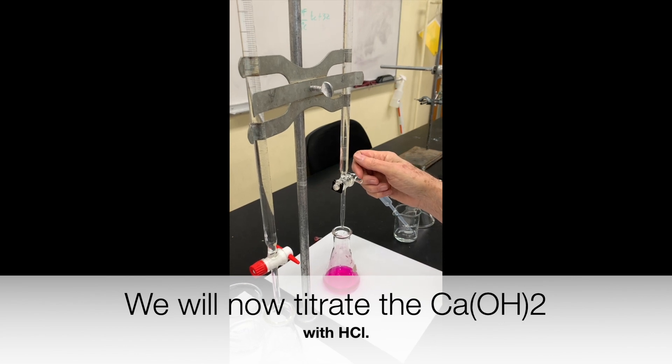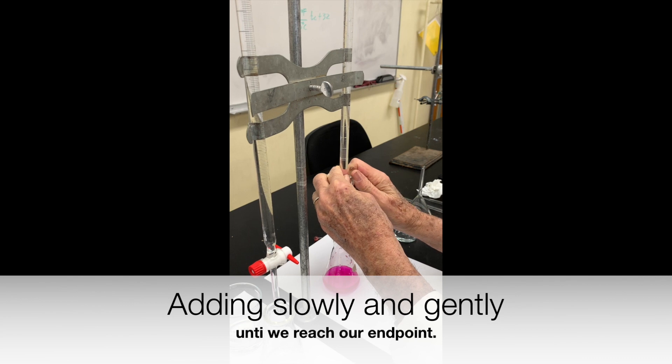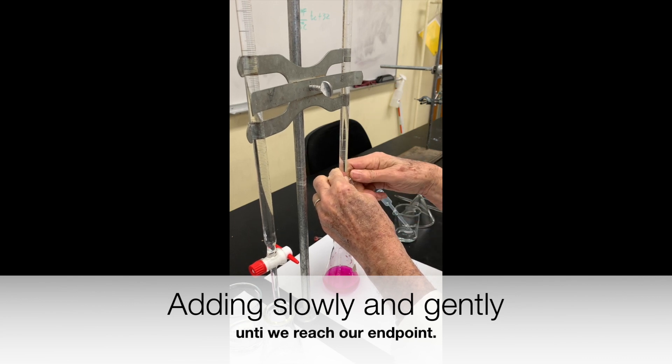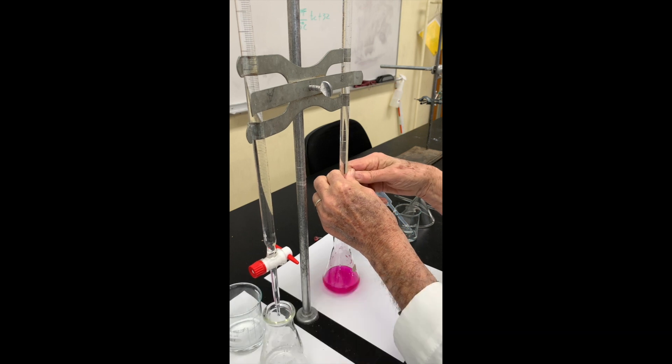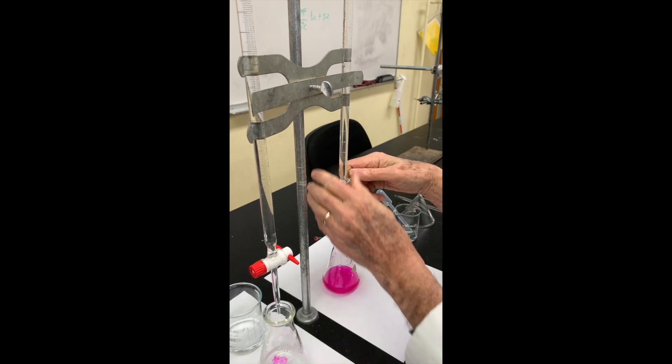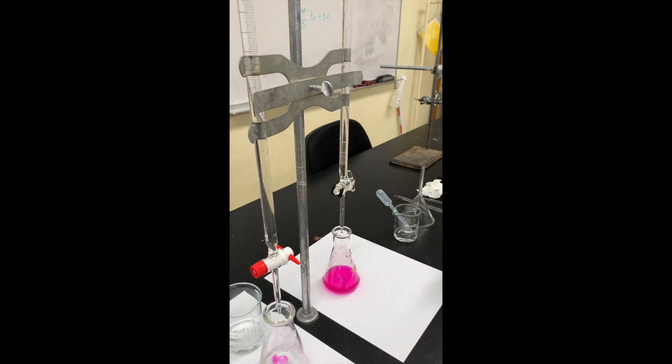We will now titrate the calcium hydroxide with hydrochloric acid, adding slowly and gently until we reach our endpoint, going for a faint pink.